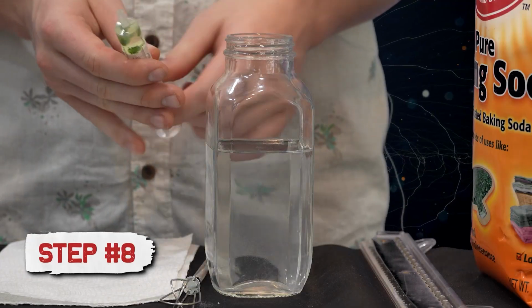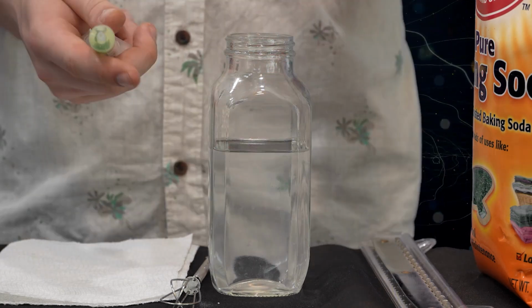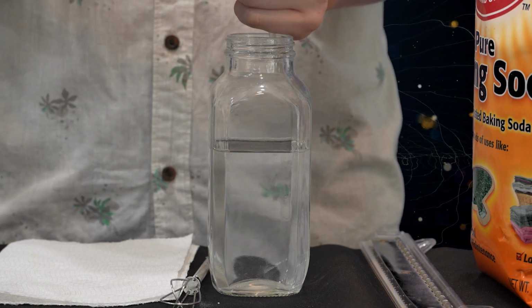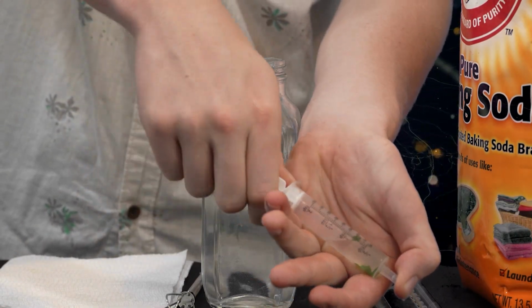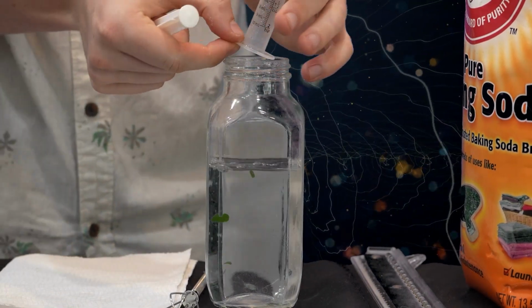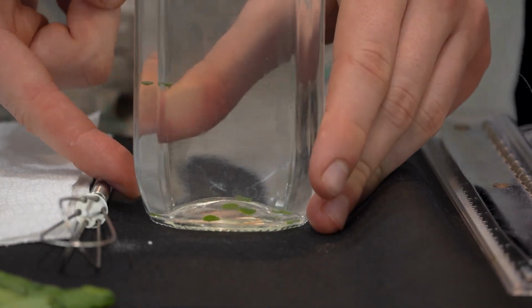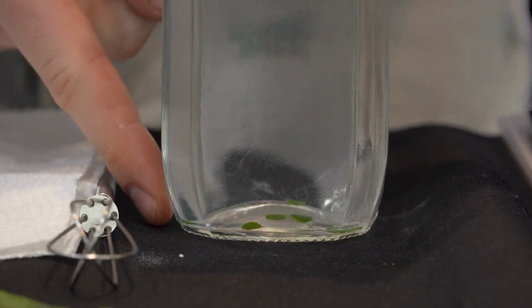Now that we have all of our spinach leaves, we're coming back to our larger container of water here. So what we're going to do is empty all of this back into our larger container. Like this, the water won't fall out and the leaves will go into the cup with all the water, hopefully. So as you can see right now, all of the spinach leaves are on the very bottom of the container. None of them have risen to the top of the container, but that is going to be our goal.